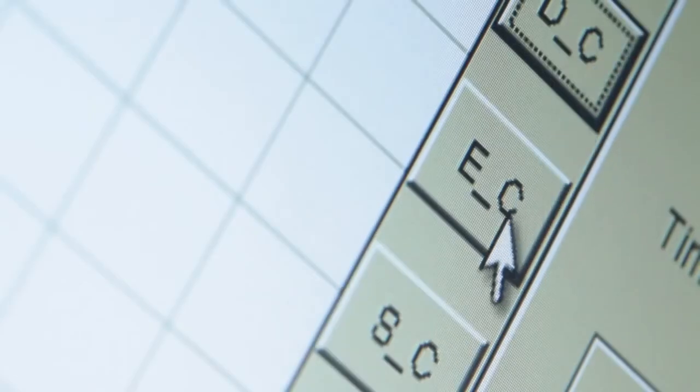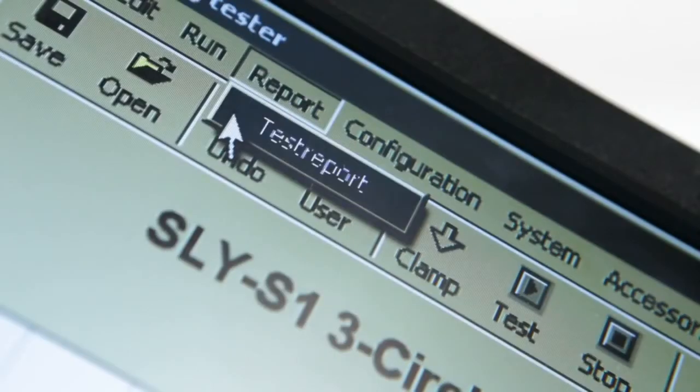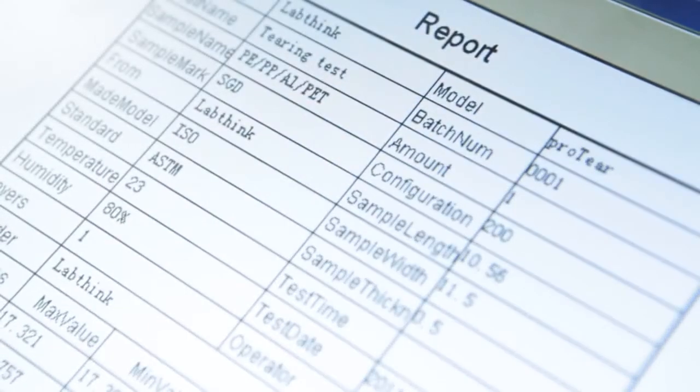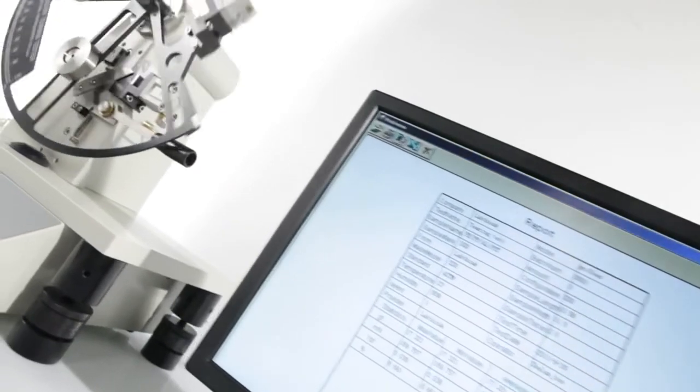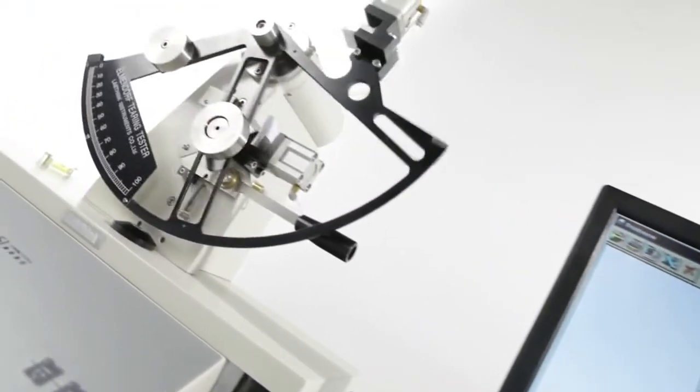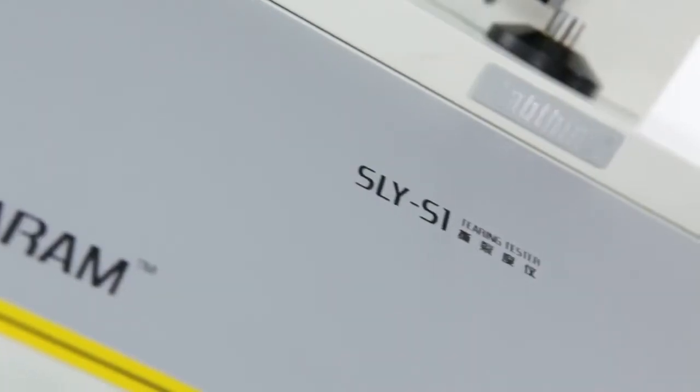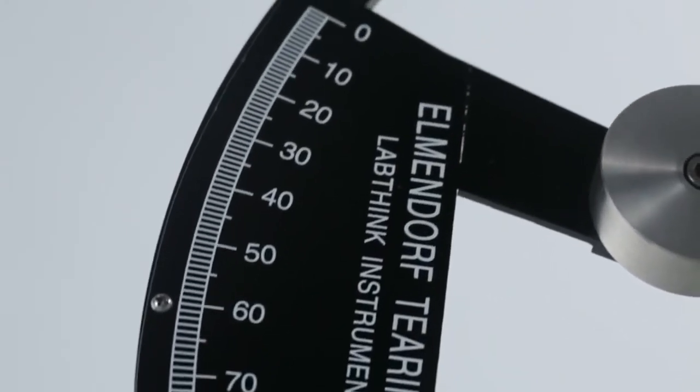including discrete circle, error circle, and standard circle, which help users easily understand the correlation between test data and thus properly analyze and evaluate the quality of the specimen.